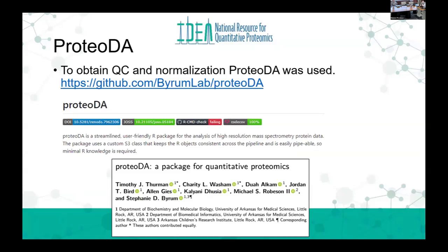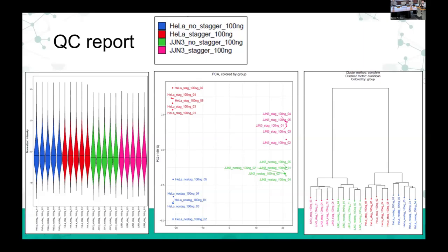And so using this product that Stephanie's going to talk about tomorrow morning, ProteoDA, which was developed here by the team of bioinformaticians that she works with, we come up and I could do this. Now I'm not bragging, but if you were to take 2 different cell lines and then two different methods, this is how you stack the cards against you. Could you get better groupings here than you have?